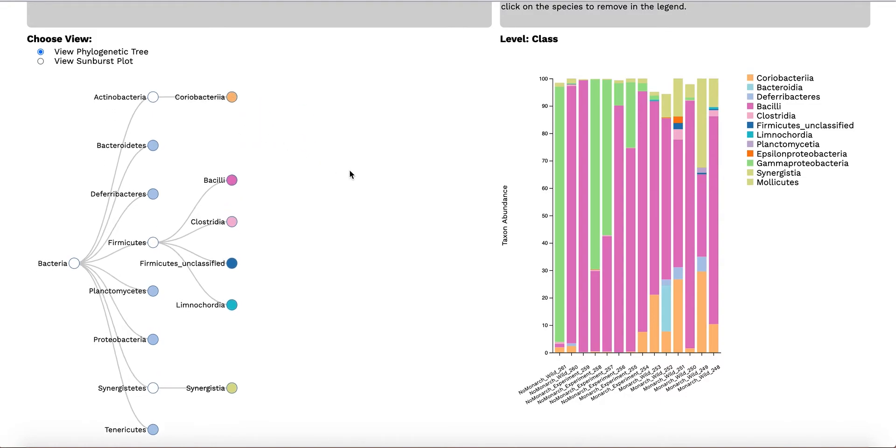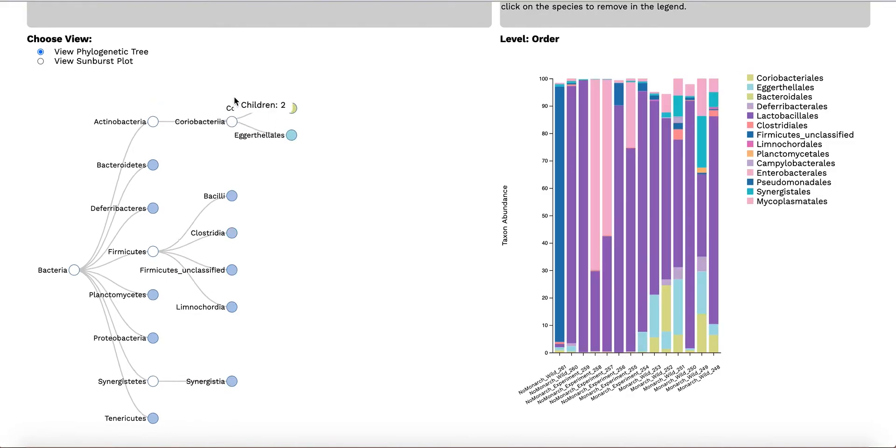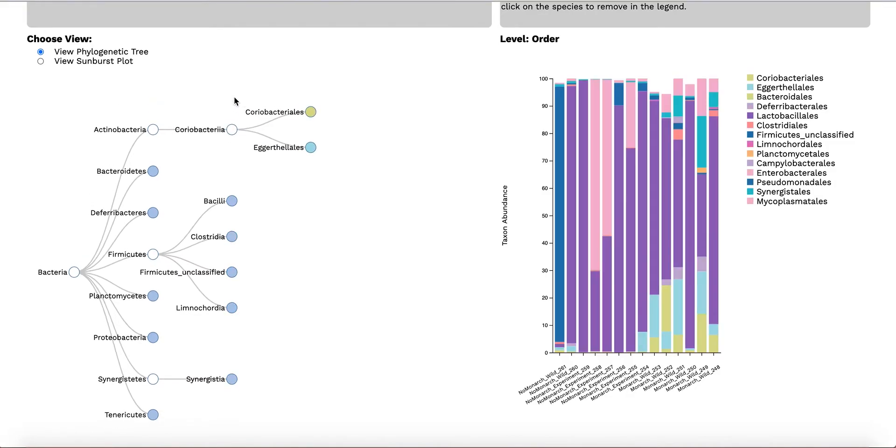On the right, the user can see a stacked bar chart displaying abundances according to a specific level of classification across all samples. As a tree expands its depth, the stacked bar chart will update abundances according to the deepest level of classification that the user is in.